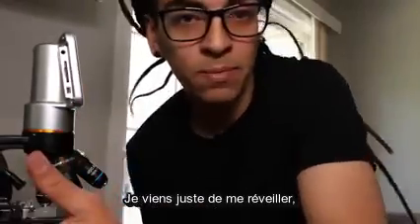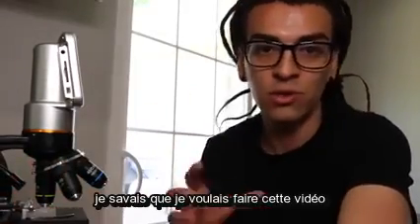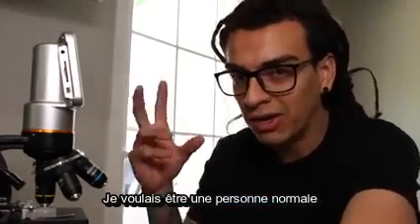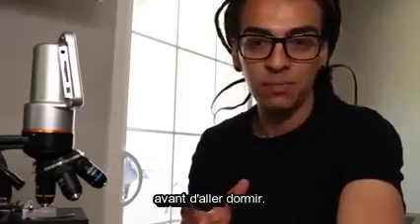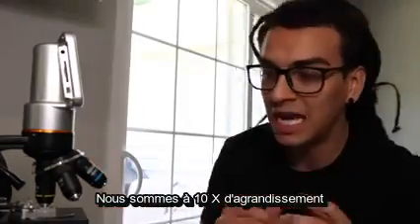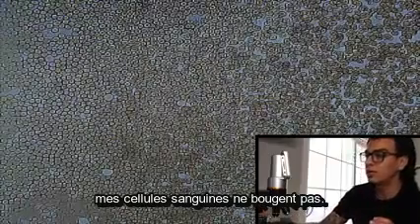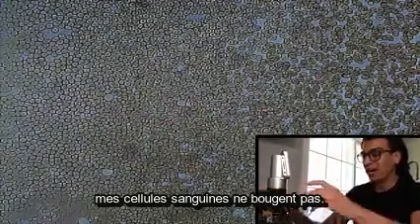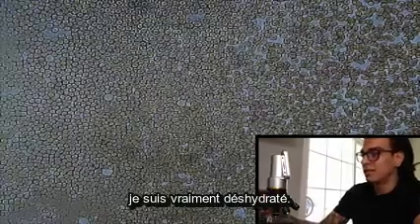So I just woke up, right? I didn't drink water last night because I knew I was gonna do this video today. So I wanted to be the regular person that doesn't drink as much water before they go to sleep. So right now we're at 10 times zoom, and you can see that my blood cells are really not moving at all, which means that I'm really dehydrated, and this is how my blood is right now.